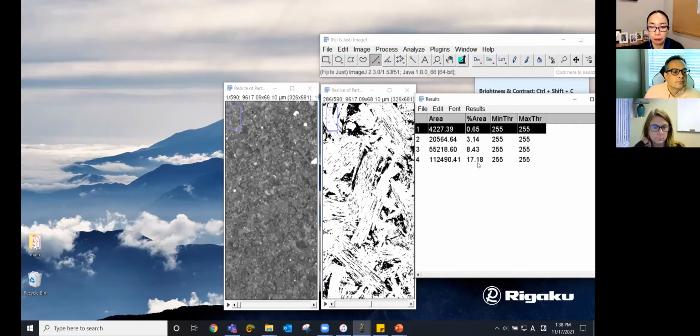So reconstruction software usually comes with a CT scanner, and that's probably the best choice to do the reconstruction. If you don't have one, you have the hardware, but you don't have access to reconstruction software, there are open source reconstruction programs, I can't remember the name right now, and software packages like Dragonfly have their own reconstruction program.